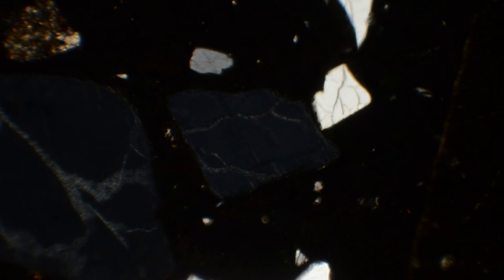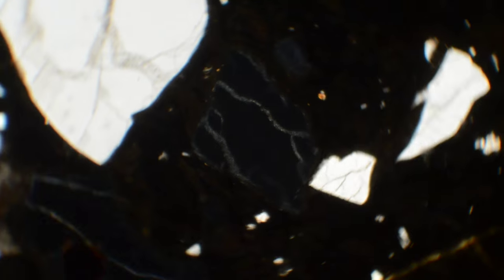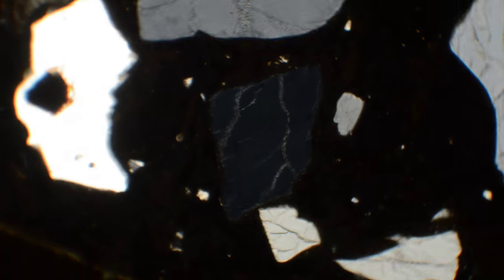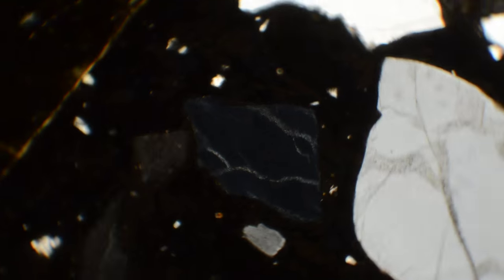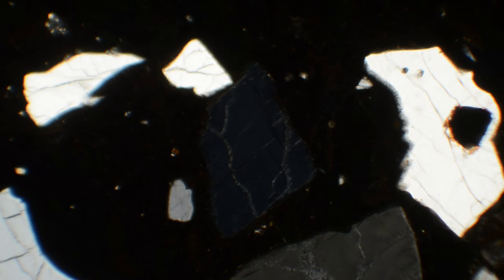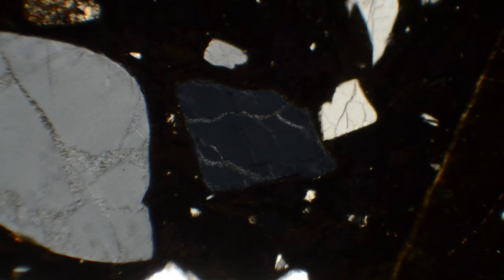Let's try an example together. Here, I start in cross polarized light. As I rotate the stage, pick out what you think is the best grain to use. This grain in the center has the lowest retardation, so we should use that.